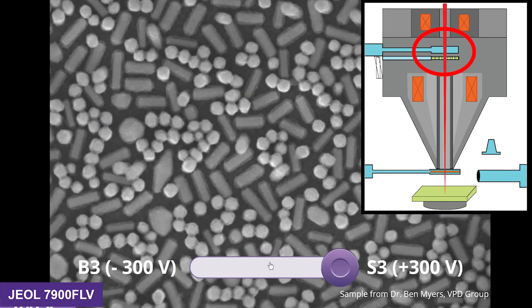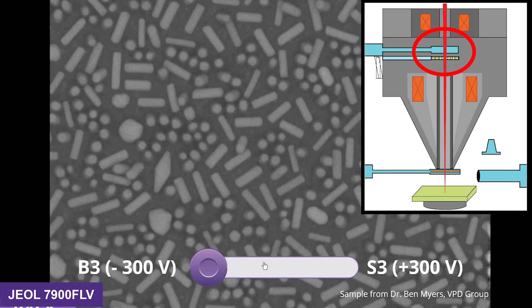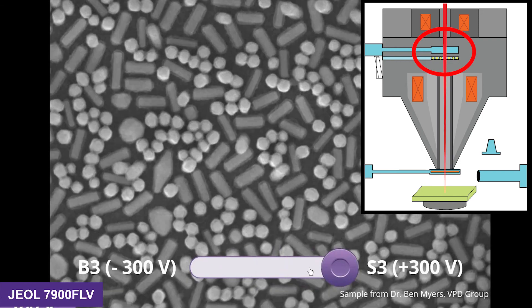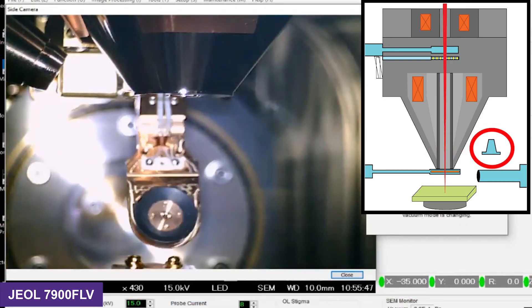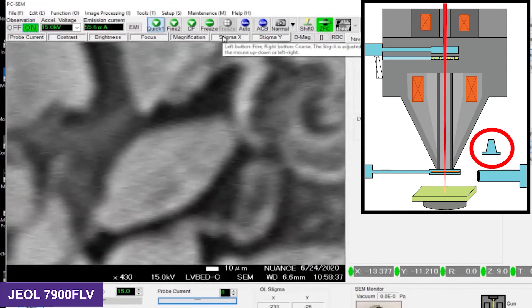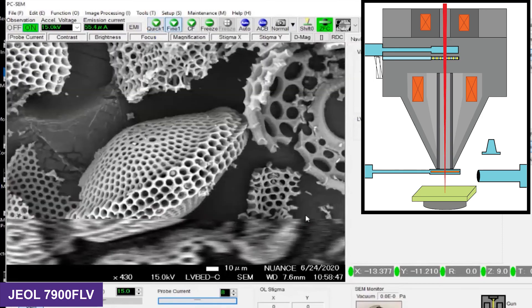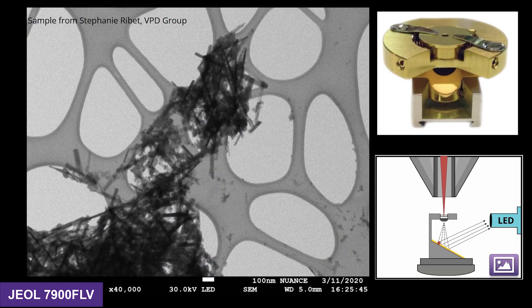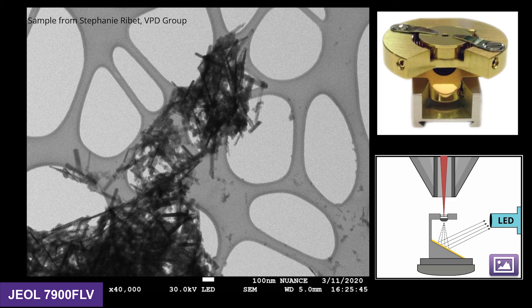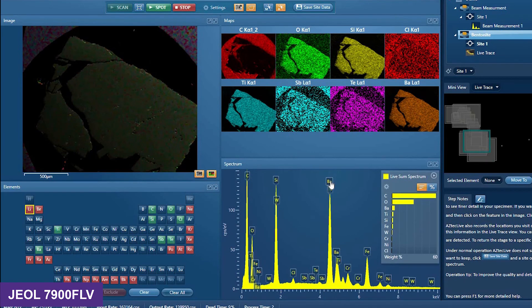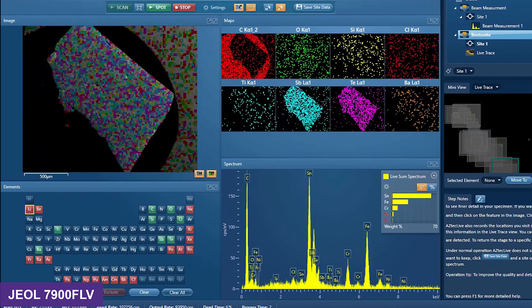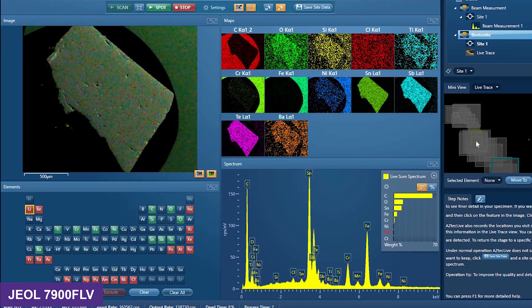It also has an in-lens or upper detector with an energy grid filter which allows you to filter out SE and backscattered electrons. It has a dedicated backscattered electron detector and a low-vacuum backscatter detector for low-vacuum operations. This microscope also has gentle beam mode for beam decelerations up to 2 kV and a STEM holder for bright-field STEM imaging using the lower detector. The 7900 has an EDS detector with Oxford's Aztec Live, which allows live elemental mapping as you move around your sample.